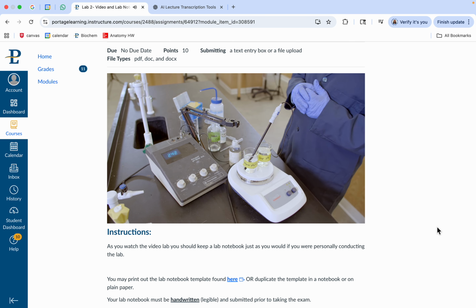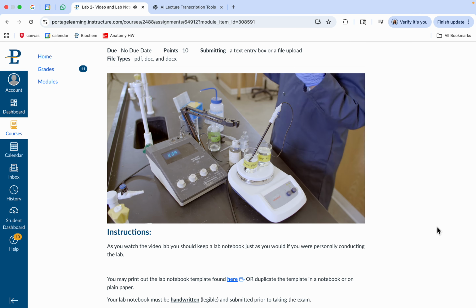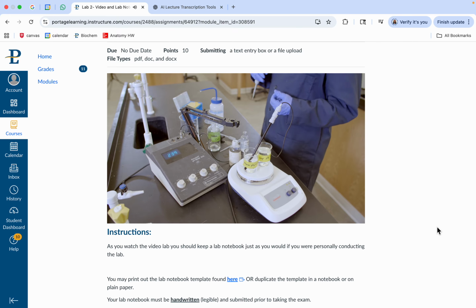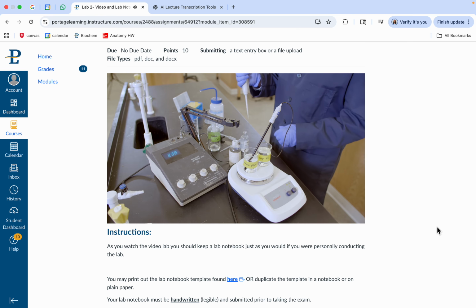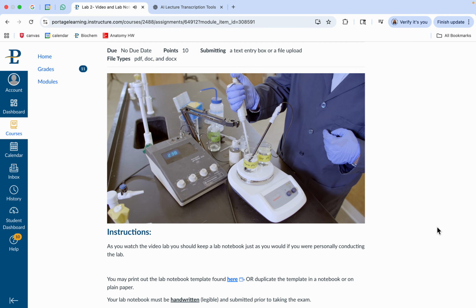All right, so again, pH of 2.35, we're at about 2.4 or so. Now we can think about our last part where we saw water and phosphate and how those differ in their ability to maintain the pH. Water's pH drastically went down to 2 or so with a little bit of HCl, and phosphate nearly stayed the same. So we're going to add, again, about 50 microliters of base to our pH 2.38 glycine solution.